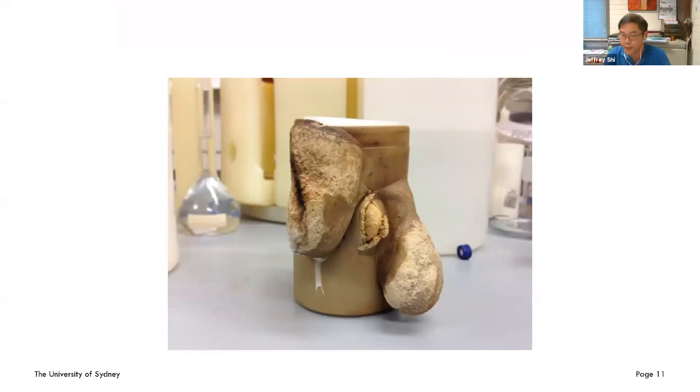See, that's the one that had the incident. The high pressure vessel can withstand 100 bar. Under normal operation conditions, that's very safe, no risk at all. But in our school, in my lab, it happened. It overpressurized and exploded.